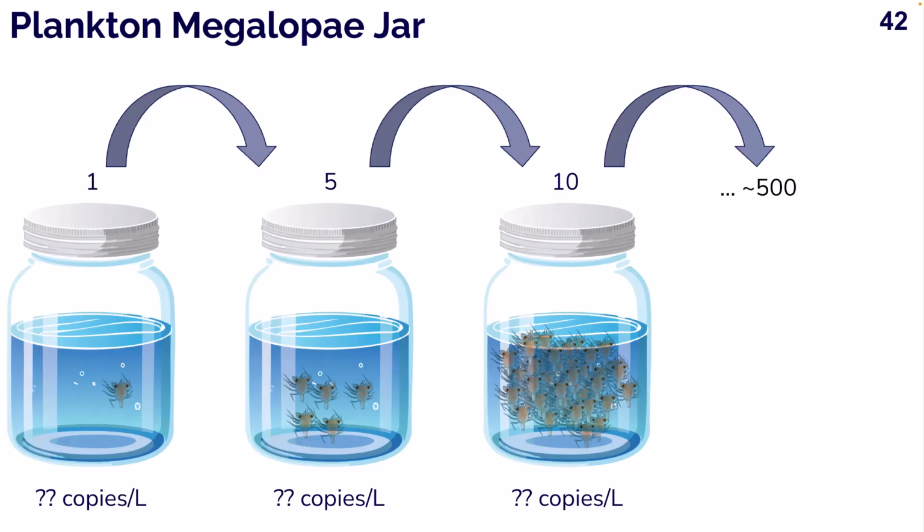We also wanted to test another aspect, since we were already creating these plankton megalopa jars. We wanted to see whether there is a difference between the 2 ethanol exchanges that occur in plankton extractions.